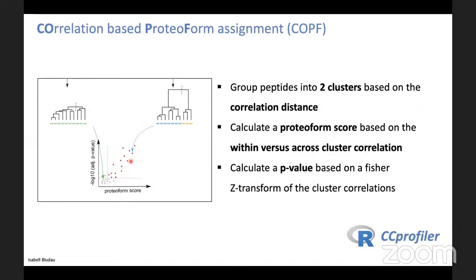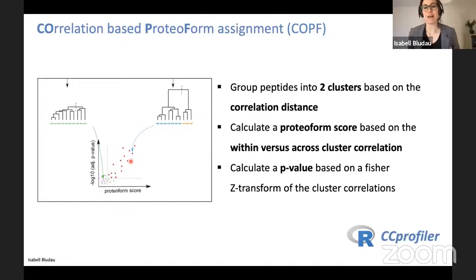Can I add a little bit to that question? Because yes, as it is the case with many PTMs, unless you perform enrichment, you will usually not see them. And that changes, well, the complete peptide mixture that you're analyzing, and you wouldn't be able to see the picture of the whole protein anymore without disturbances due to the enrichment. Will it still be possible to do the analysis like this? Yes, so I will get to this maybe in a few slides. So we actually did perform a targeted extraction of phosphopeptides in our data. So maybe I postpone the answering of this question to in a few slides.